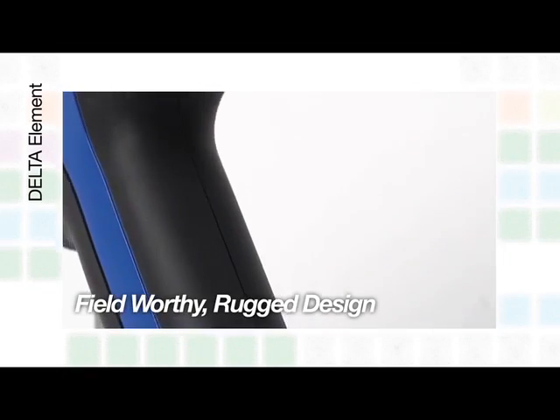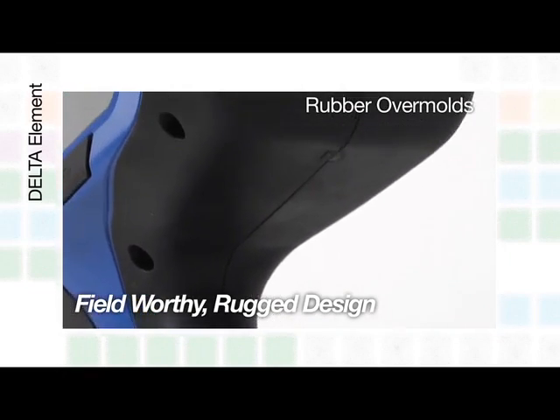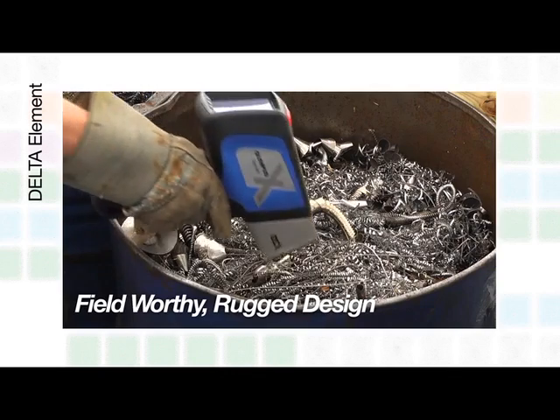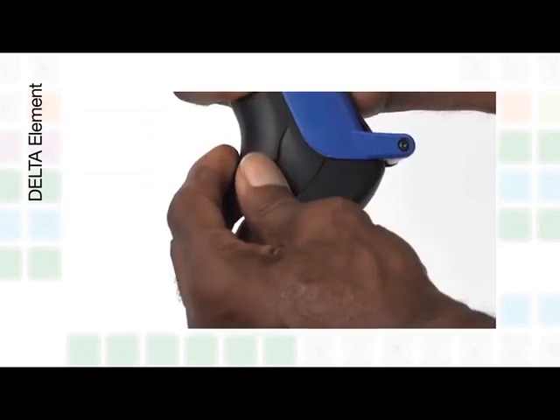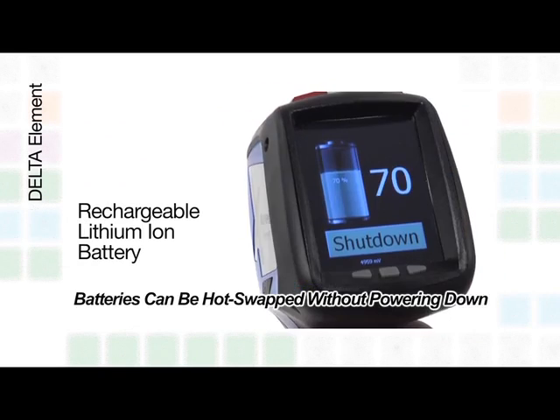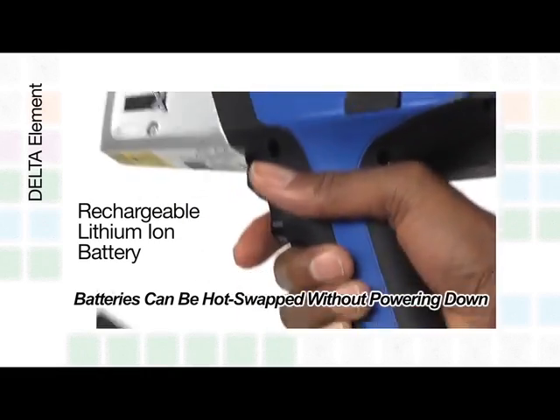The Element's field-worthy and rugged design features rubber overmolds and a thick cap-on measurement window to protect the analyzer in tough processing environments. The rechargeable lithium-ion batteries can be hot-swapped or changed without powering down the analyzer.